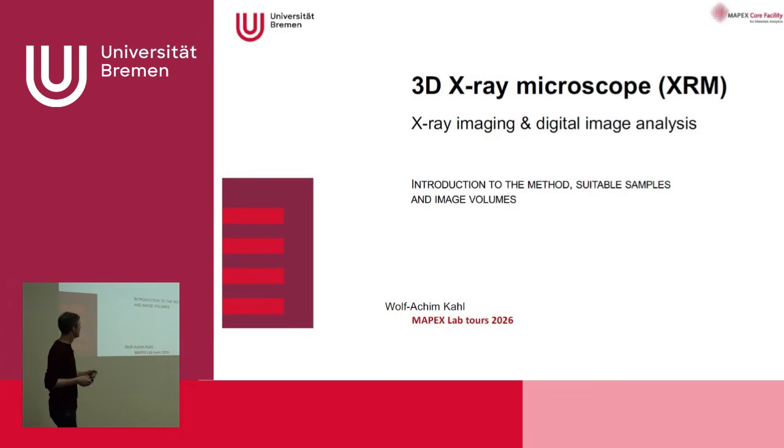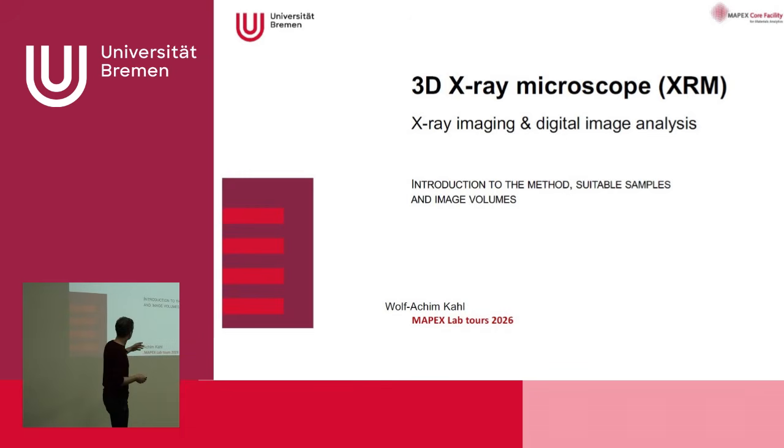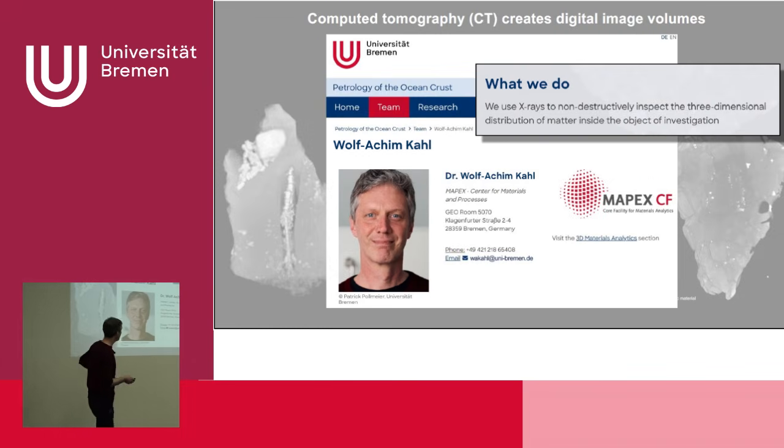So we introduce the method, we get to know maybe suitable samples, and learn something about image volumes. If you want to contact me, I'm the lab manager of this X-ray Microscopy lab. I'm sitting in the Geo building, and I'm sure we can exchange my contact address later in case you don't have it.